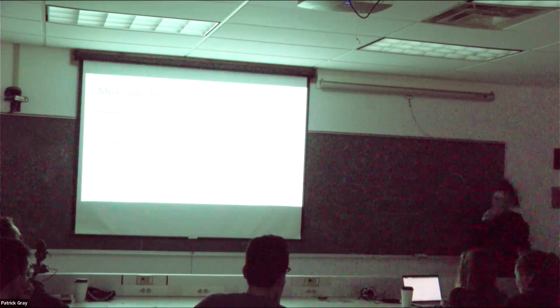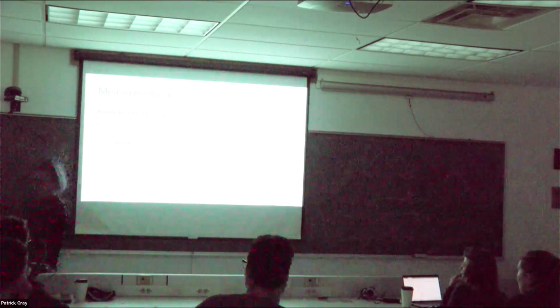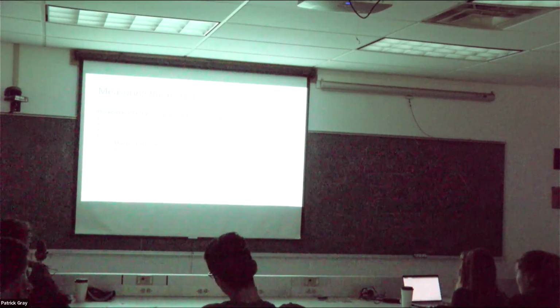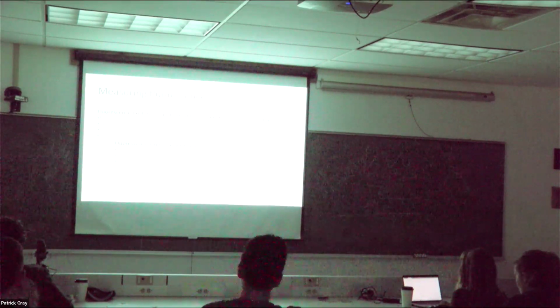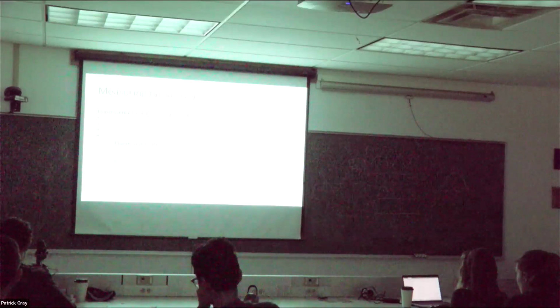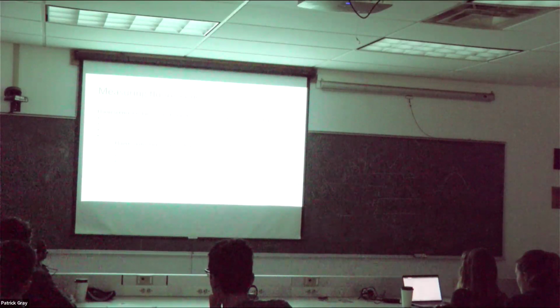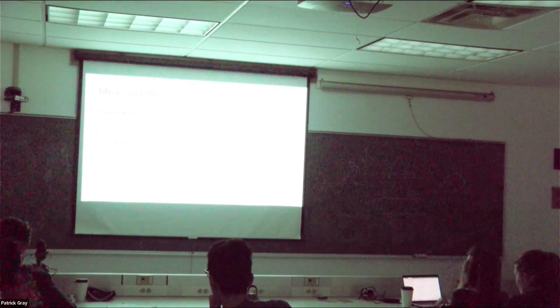Fluorescence is not easy. We're going to go slowly, tell me. So with that first point, if you had a pure sample of some pigment, something that fluoresces, a super pure sample, and you excite it at too short of a wavelength, you won't see anything. And if you excite it at too high of a wavelength, you won't see anything. With the fluorescence emission spectrum, you're kind of exploring where that Stokes shift happens.